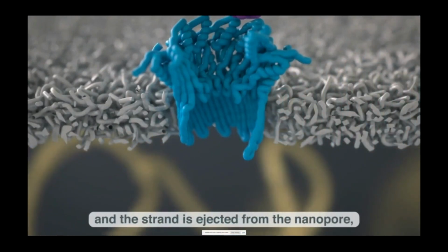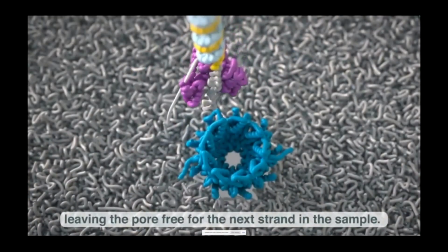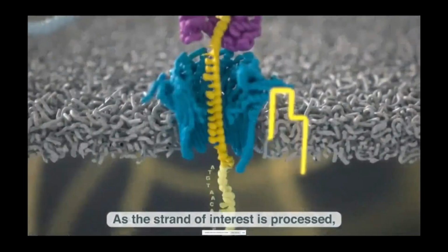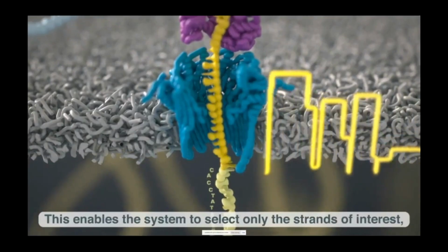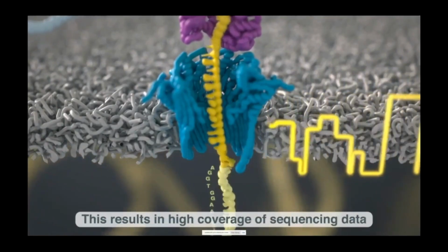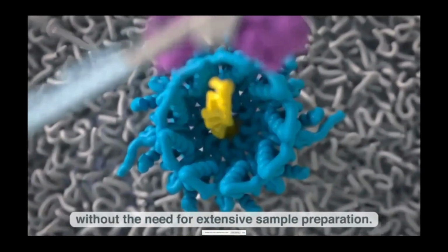So you can throw molecules away and you can choose to sequence another molecule. And you can do all of this in real time. And this adaptive sampling or read until, when we first started working on this many years ago, is one of those kind of space age ideas about sequencing that's been so exciting to be involved with.